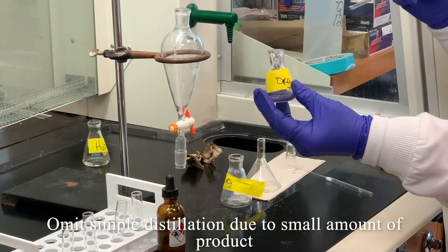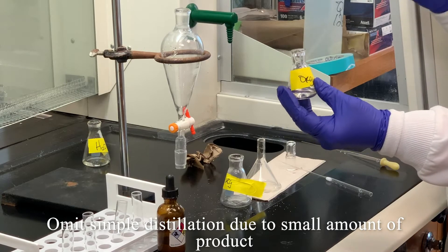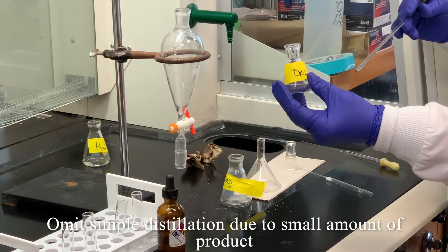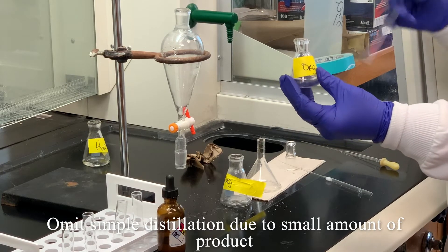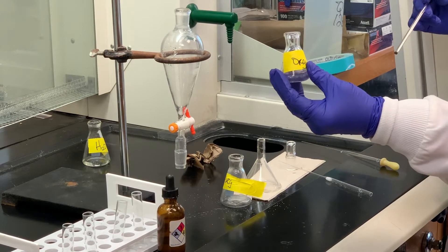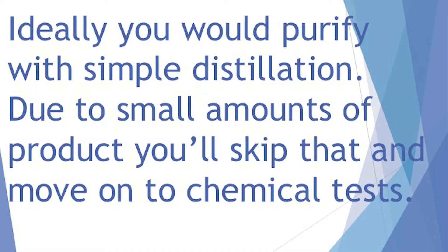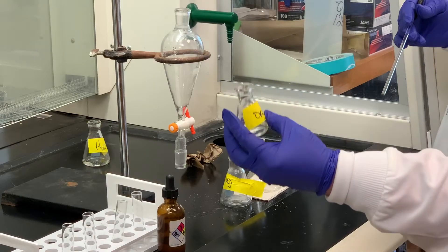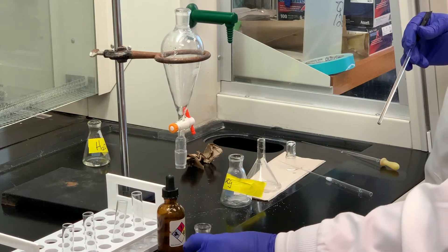I will say this: if we wanted this to be pure for analysis or to use this compound in another reaction where purity really mattered, then we would try to take the time to do that simple distillation, albeit we're going to lose material in doing so. Our goal today is just to see if we were successful in producing the 2-chloro-2-methylbutane — did we replace the OH group of the alcohol with chlorine by the SN1 mechanism? So there are a couple of chemical tests that we're going to do.